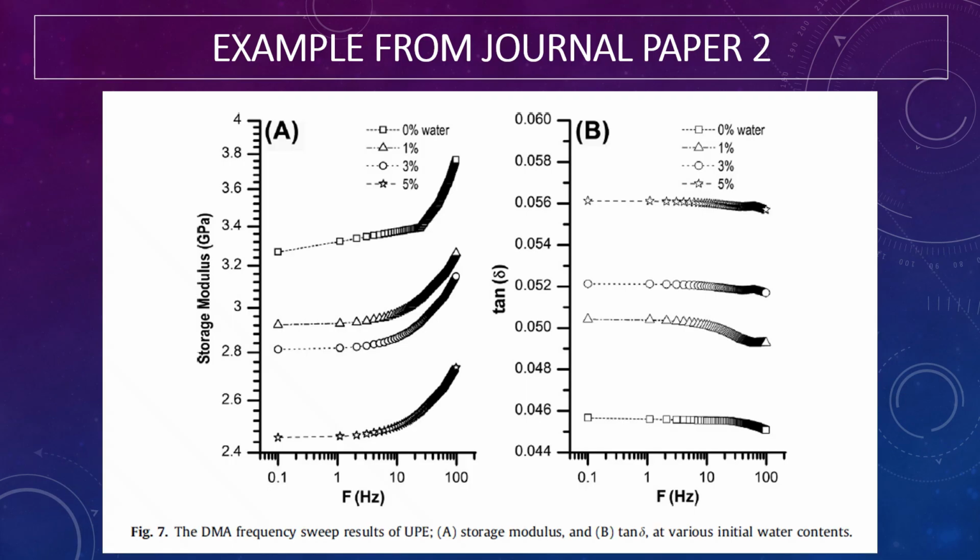This is the result they get, the graph. When the frequency is higher, the storage modulus gets higher. At higher frequency, it is more elastic. And for 0% water, the elasticity is higher. For the tangent delta, it shows the opposite, where the 0% water is lowest.